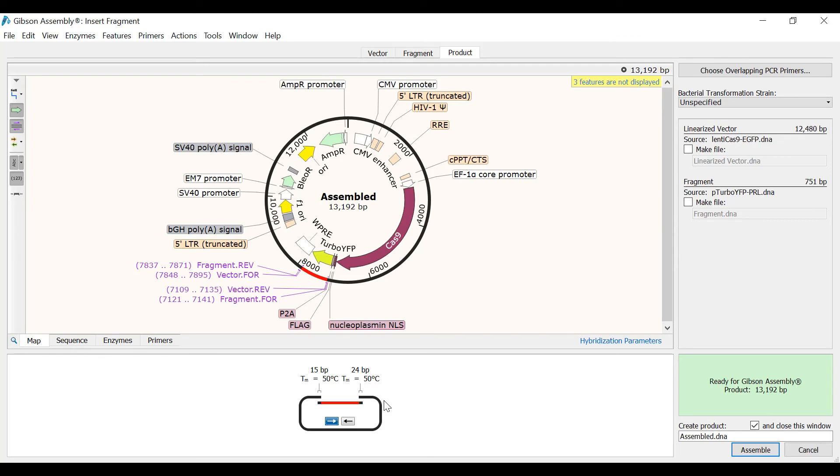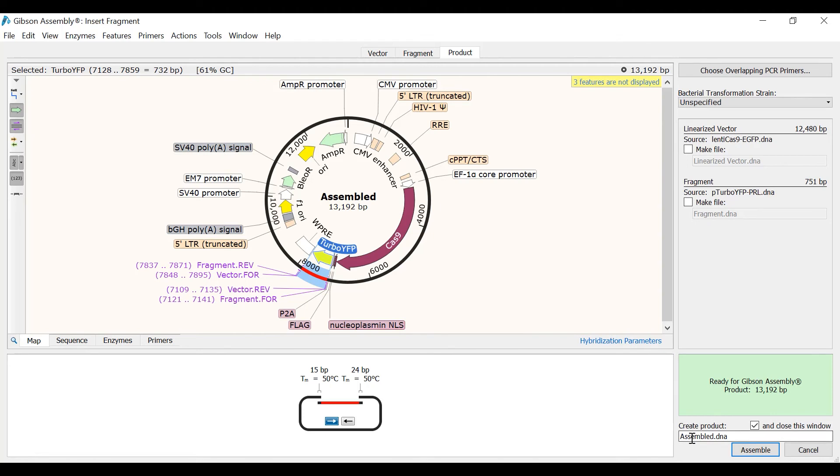In the map view I can preview the final product. The fragment insert, in this case the TurboYFP feature, has been inserted into the vector in place of the EGFP feature. To finish the simulation, I will call the file Lenti Cas9 TurboYFP and click assemble.